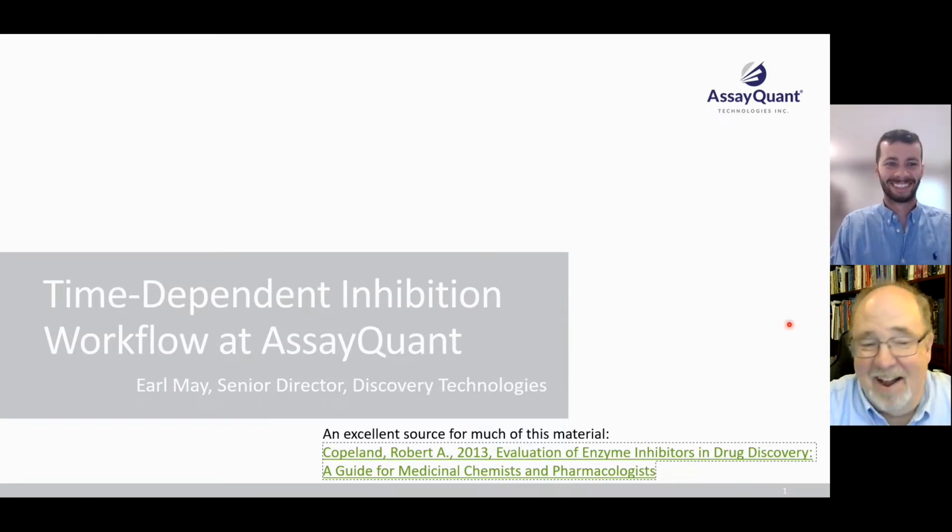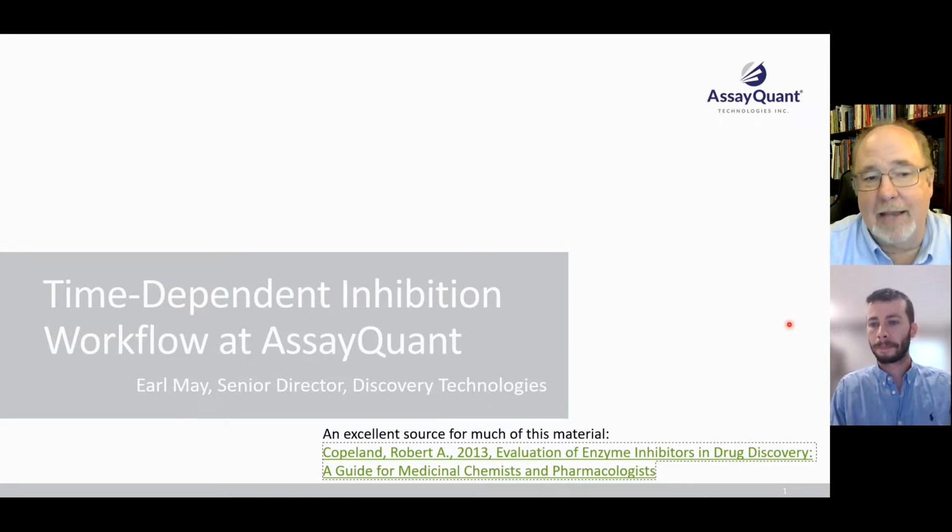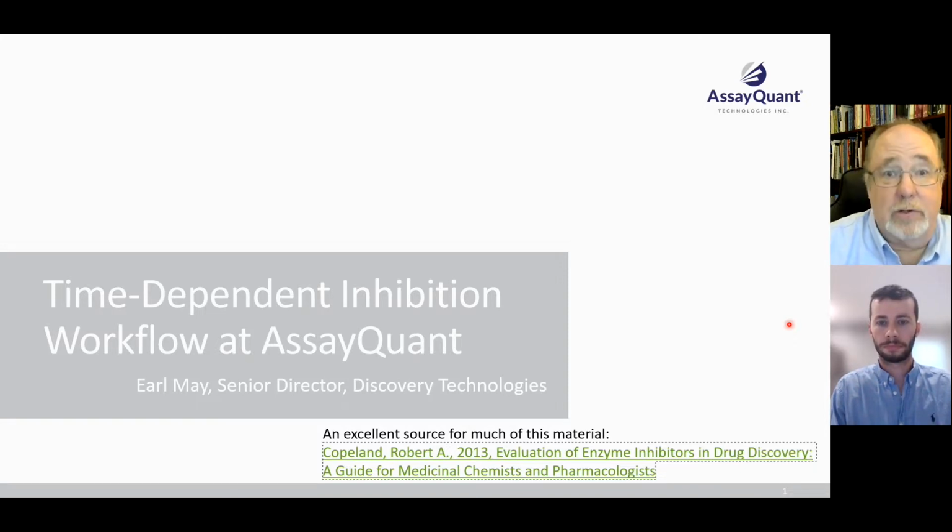Thanks a lot, Jack. I'm going to talk to all of you today about how we handle time-dependent inhibitors using our assay system. This is how we run things in-house, but it's also how you could run it if you have our bulk reagents and want to do this in your own shop. Before I go any further, I want to flag an excellent source for a lot of the information I'll be presenting today: Bob Copeland's book on the evaluation of enzyme inhibitors in drug discovery.